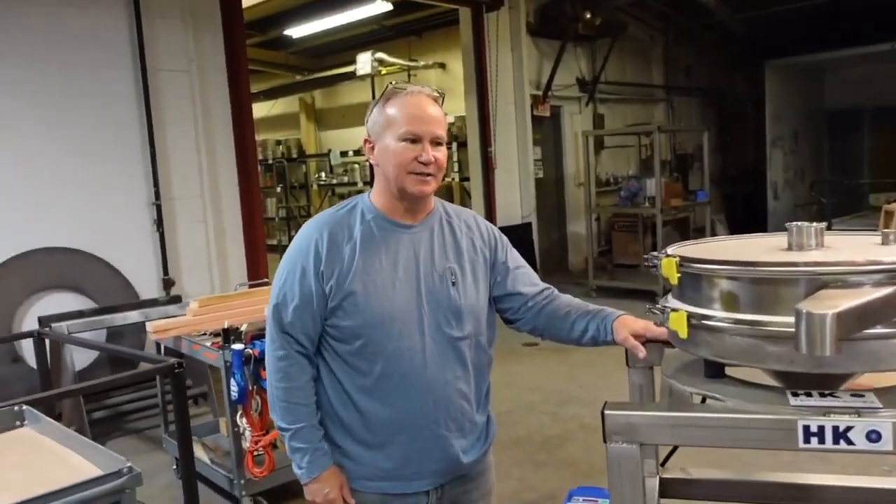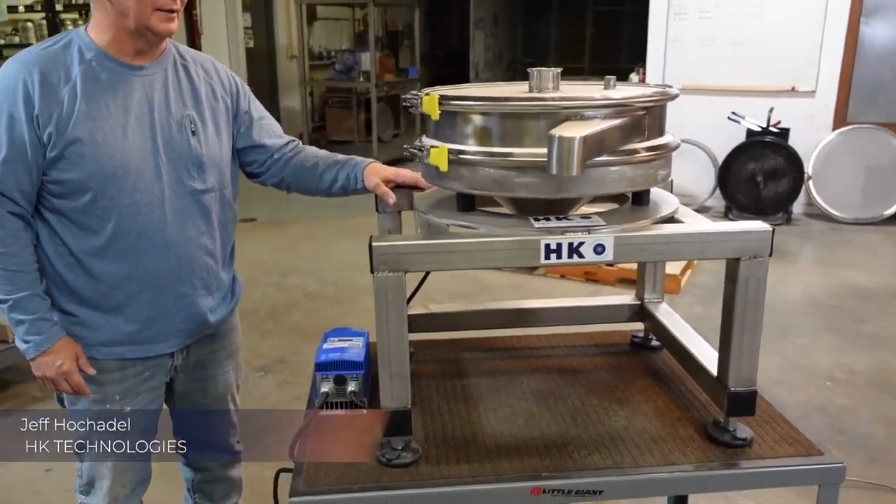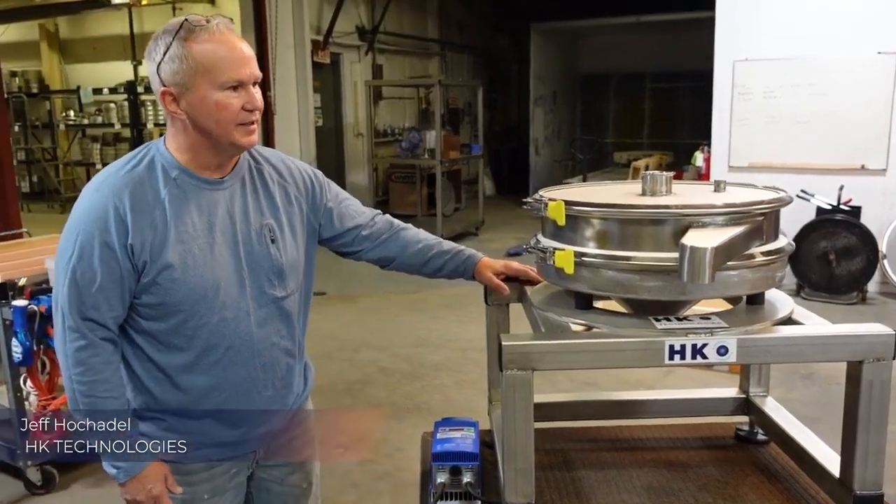With HK Technologies, I'm here to introduce the HK C-17 Low Profile. It's a compact, inexpensive sieving system.